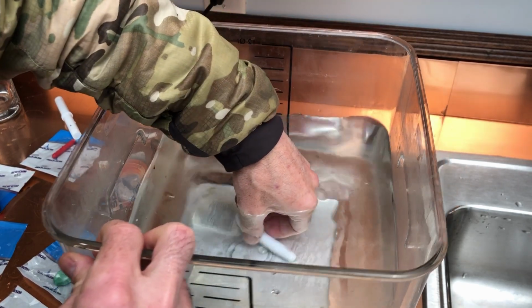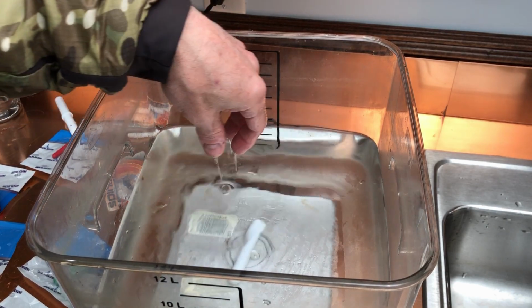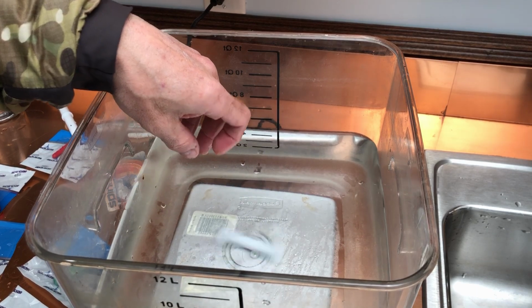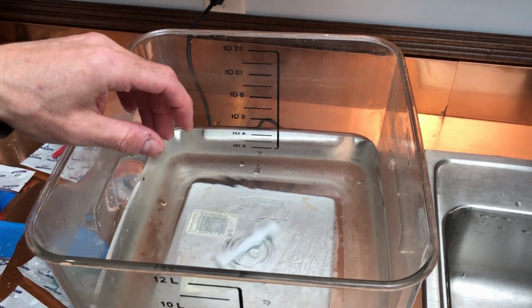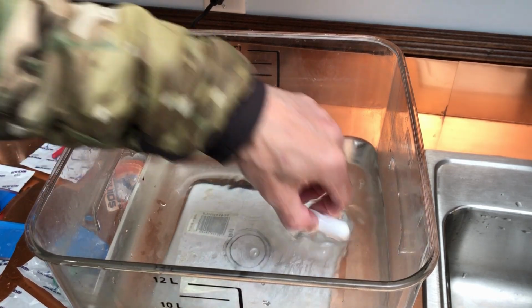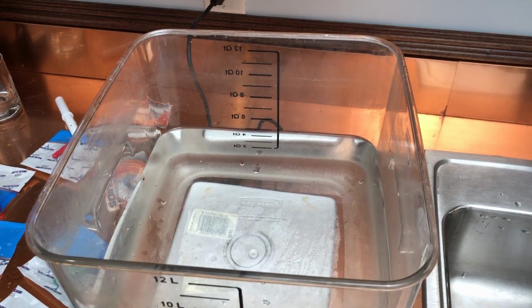Yeah, it's just too long for this plate. So there are plates with bigger rotor diameters. Yeah, I wouldn't recommend a 70 millimeter or a 60 millimeter for this particular plate.